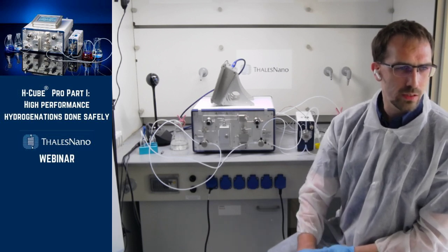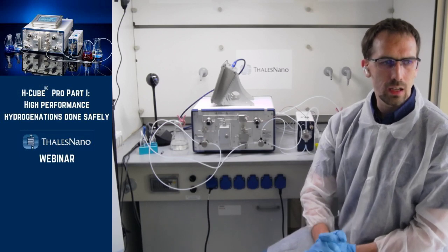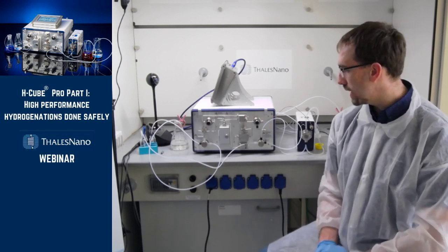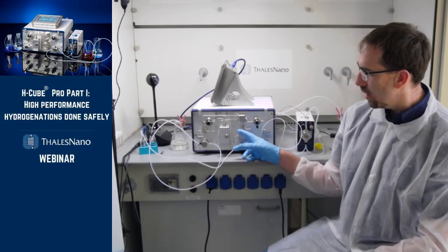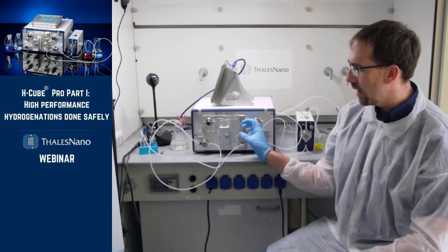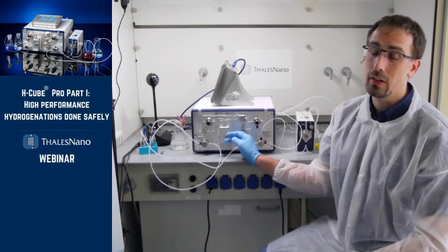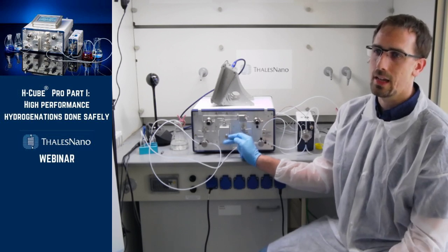Any specific reason for not recommended to general flow reactions? I guess this question refers to the previous one on what kind of reactions can be performed on the H-Cube. So the H-Cube Pro has a catalyst cartridge, and it will be ideal for those kind of applications which need a catalyst cartridge.